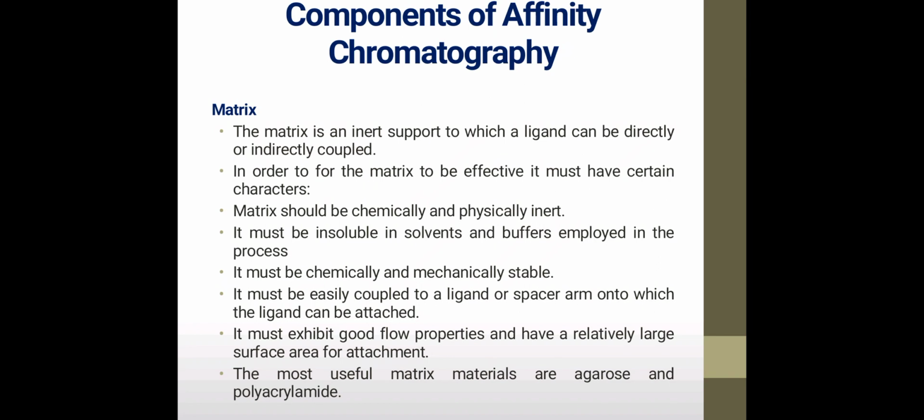So this matrix is a very important component in the stationary phase, to which the ligand or the spacer arm will be bound, so that the analyte to be separated, while passing through the mobile phase, will get specifically bound to the ligand.